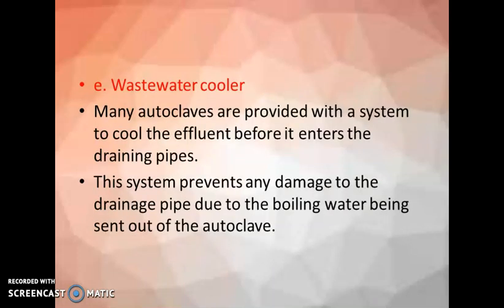Next is the wastewater cooler. Many autoclaves are provided with a system to cool the effluent before it enters the draining pipes. This system prevents damage to the drainage pipe, because sometimes the drainage pipe may get damaged due to the boiling water being sent out of the autoclave.